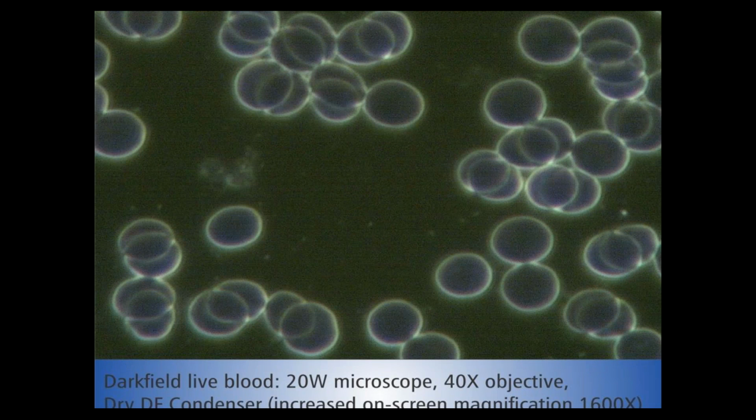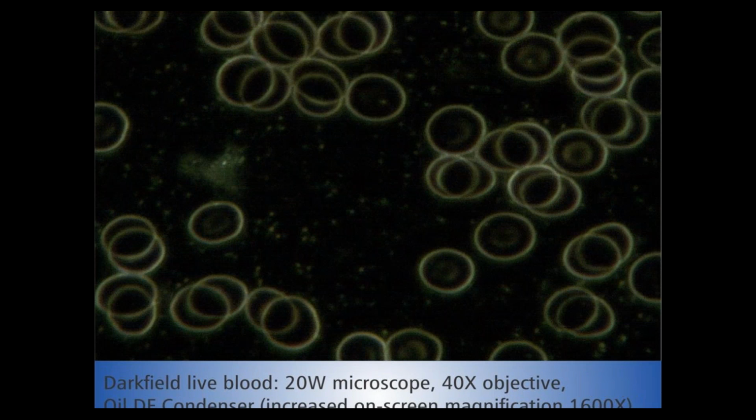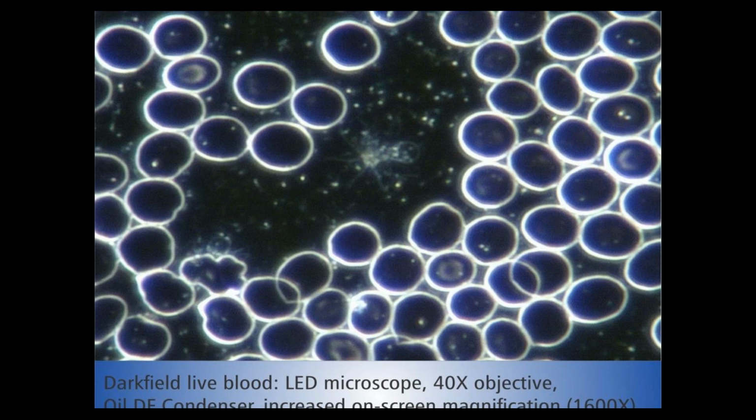And if we look at the next image, this is the same sample, also with a 20 watt microscope, but this is where an oil immersion dark field condenser has been used. And you can see that with the oil immersion condenser, it's not quite as bright. The dry dark field condenser allows through more light, but even with more light being allowed through into the sample, we're still not nearly close to where we should be, which is this following image where an LED microscope was used with an oil immersion condenser. Yeah, you can really see the difference there.